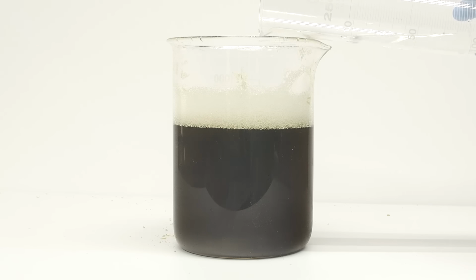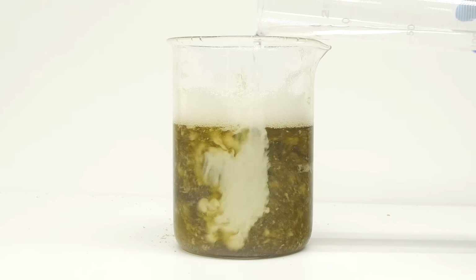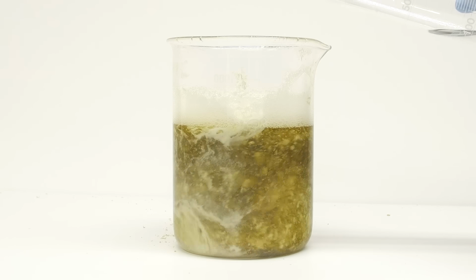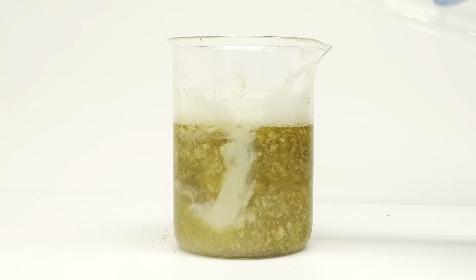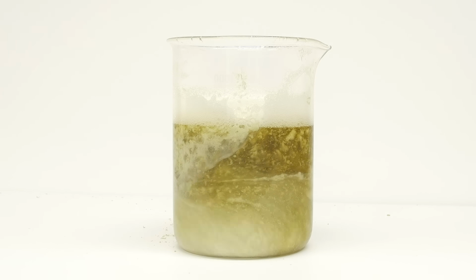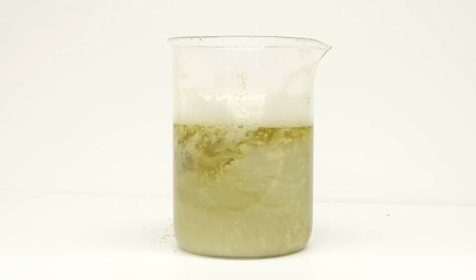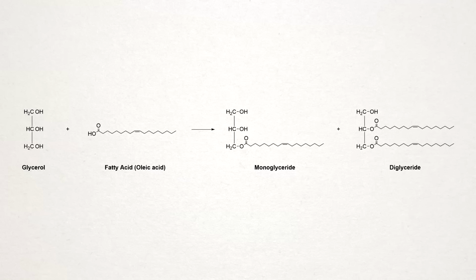According to the paper I followed, this really should have worked, but for whatever reason it didn't. Maybe my fatty acids weren't pure enough, or my acid catalyst was a low grade. This paper is advertised to be used with waste fatty acids though, so I'm really not sure. Based on my recovery of fatty acid, most of it clearly didn't react, so it might be possible that a lot of the glycerol just broke down under heat.